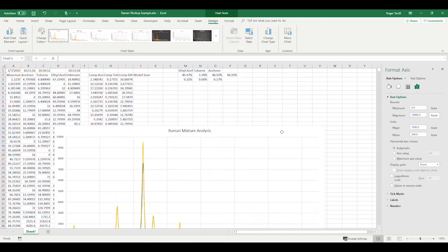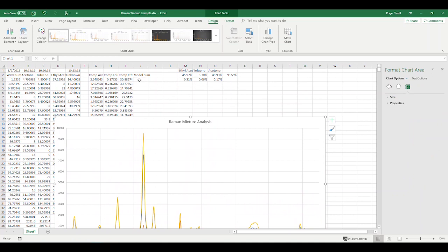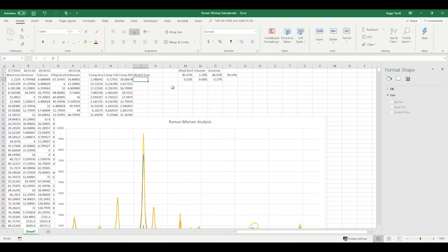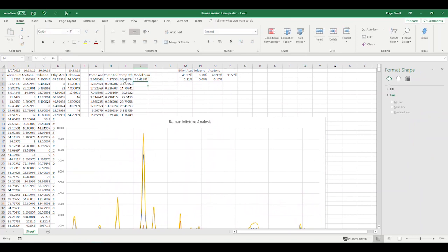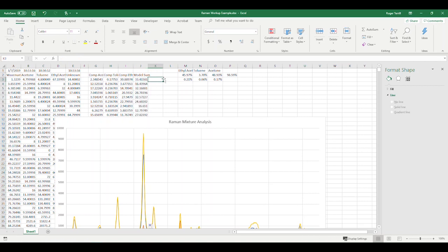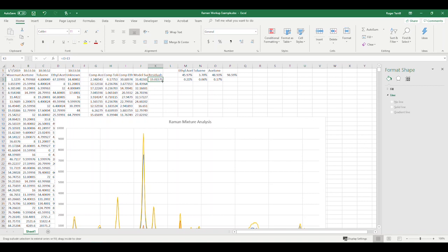And let's make this guy max out at 10,000. And that's looking good. So let's make one more column here. We'll make two more columns. A model sum. This is going to equal sum of these guys. And then we're going to make one more column called the residuals. And this is going to equal the model sum minus the unknown experimental spectrum.